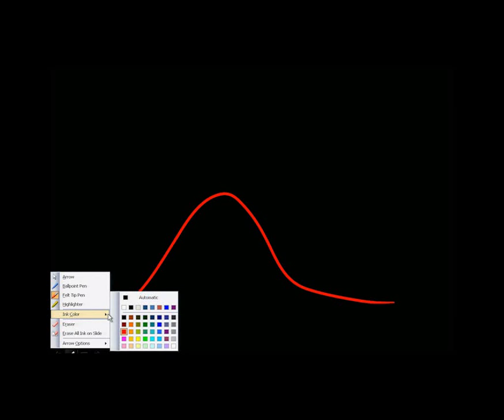If you imagine the electron beam coming down on all the different parts of this sample, this represents our sample. Well, the beam is only going to react with a certain interaction volume on our sample. So let's say the beam strikes here and it interacts. Actually, the beam will interact with a certain depth below the surface. Okay?